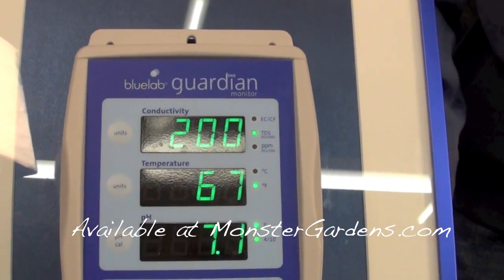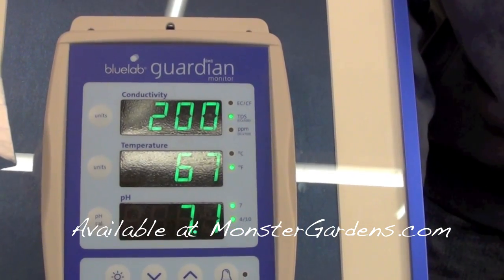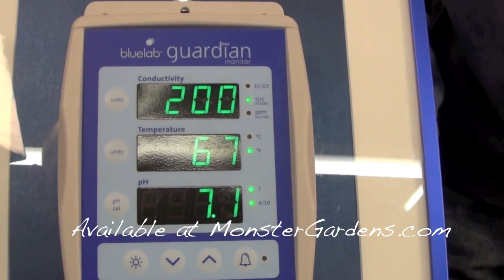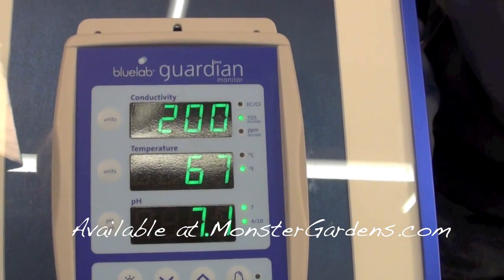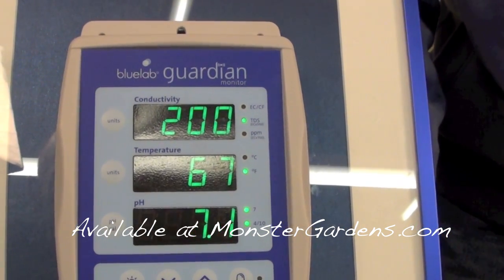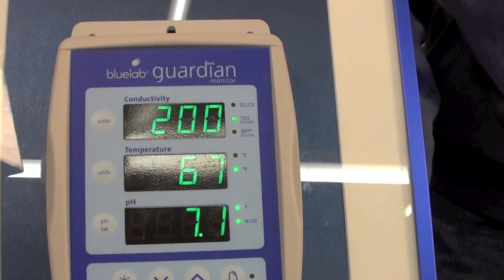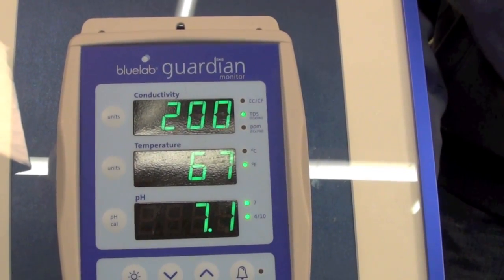In essence, it's not truly a parts-per-million meter, but it is a benchmark that lets you quantitatively gauge how much salt you have dissolved in a nutrient solution so you can back off or increase. It's a pretty accurate measurement — it just won't tell you exactly which nutrients are dissolved in the water, but most solutions come prepared.